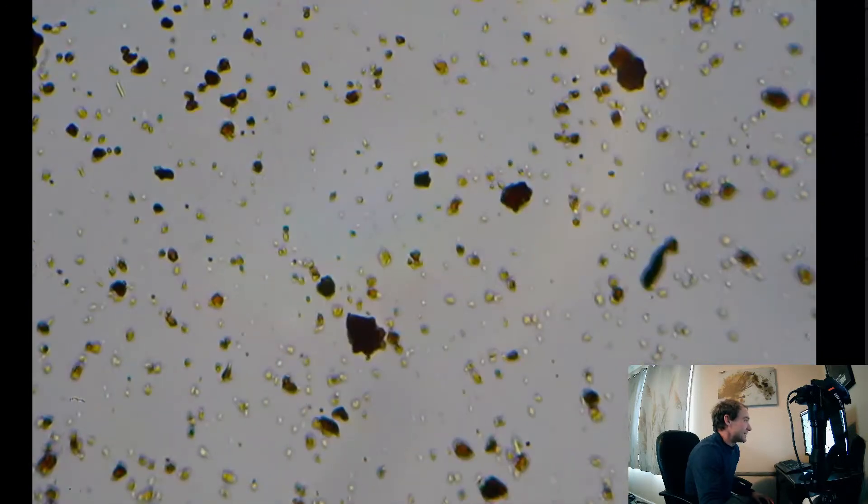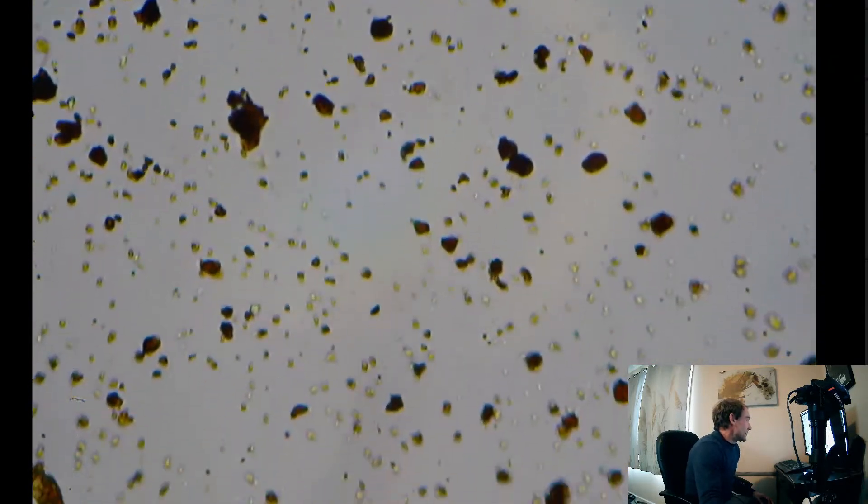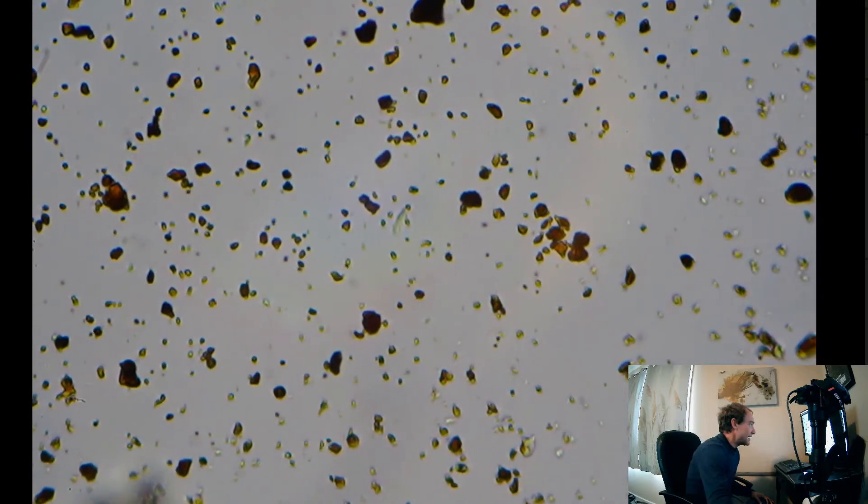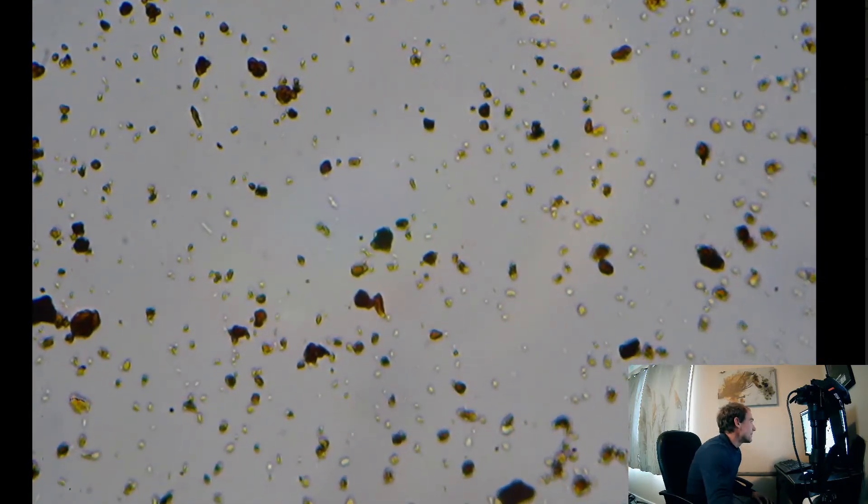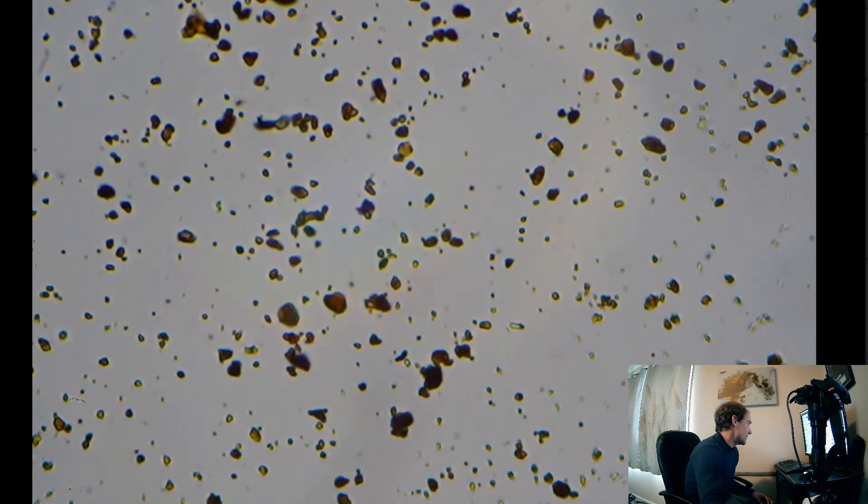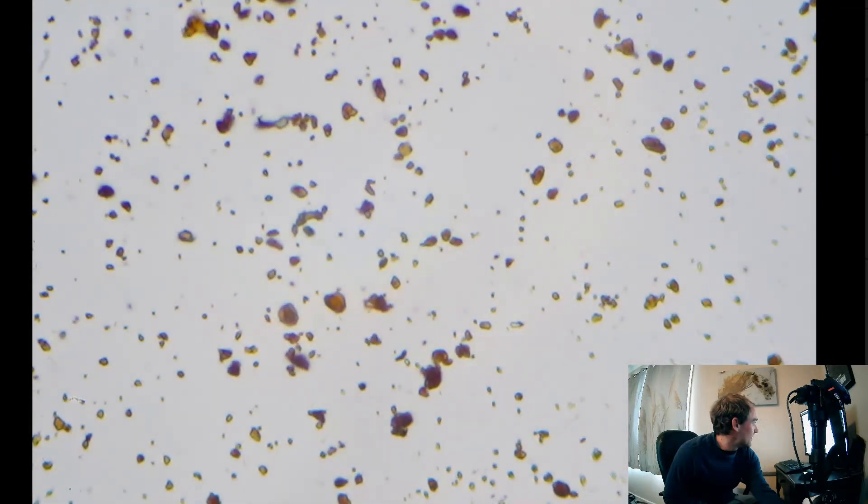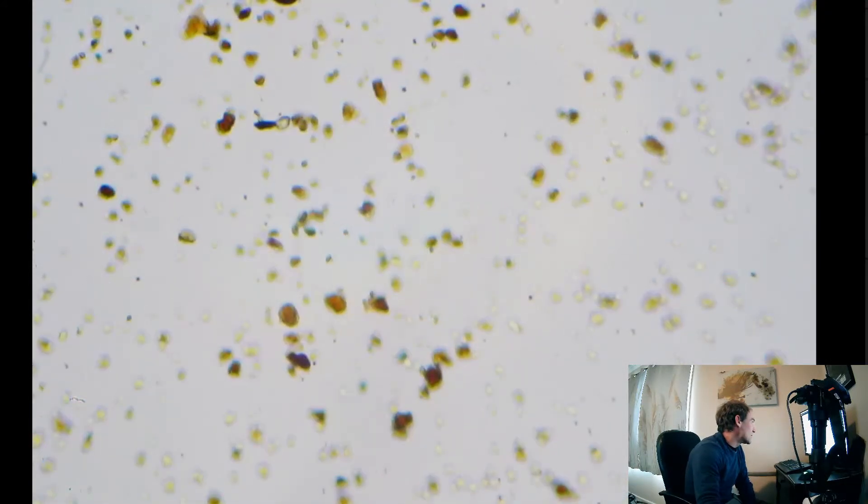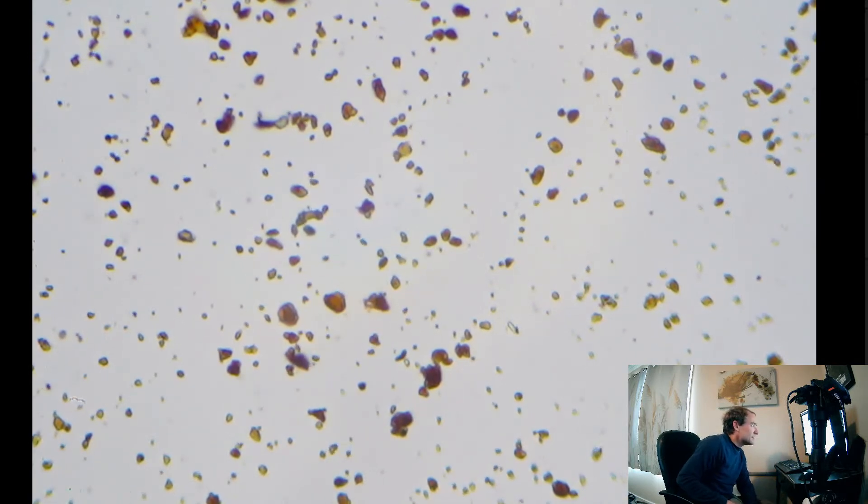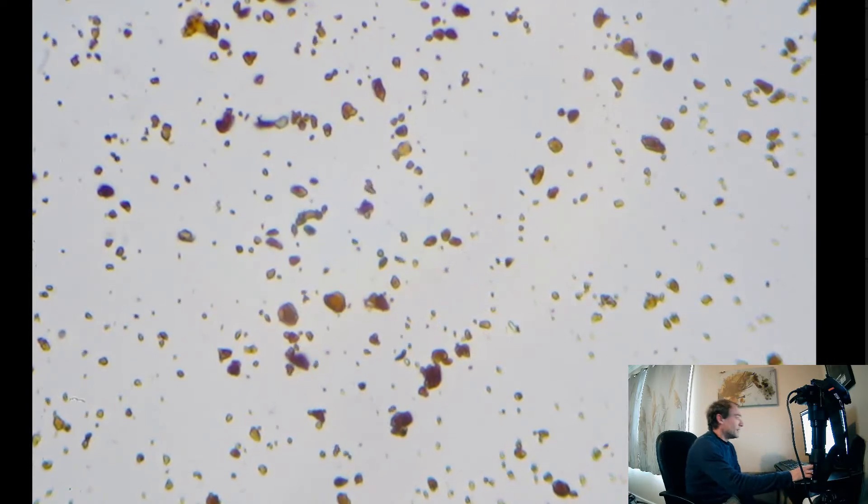Let's take a peek around, see if there's anything else interesting we could find to look at here at 600x. But pretty uniform, we're seeing the same thing throughout the whole slide so far. A little bit of shading off. Shine a little bit more light through some of those things. You can see a lot of these little round things.